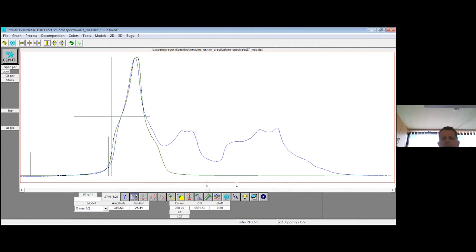Okay, and then let's proceed with the second line, which will again be this quadrupolar line shape, and we will put it over here. Okay, I guess this is perhaps closer to 0.5. I don't know. Let's try it. We'll see what we get at the end. Probably it's a little bit larger.